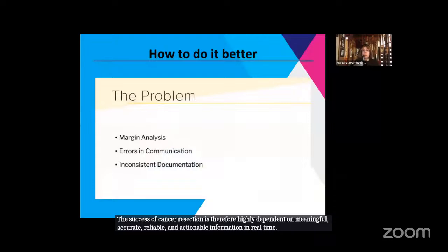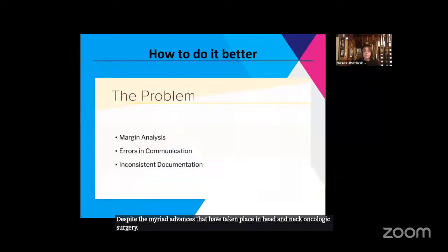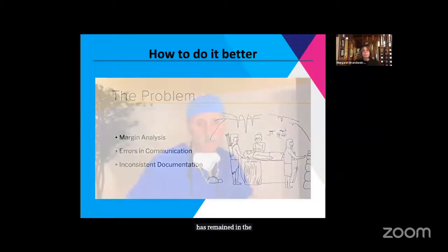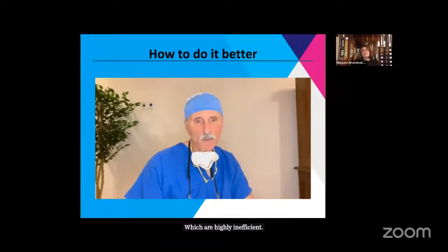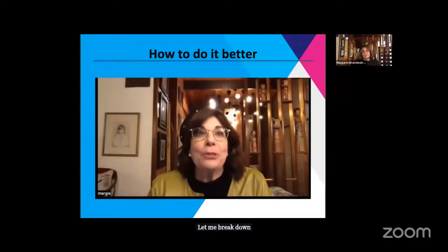Despite the myriad advances that have taken place in head and neck oncologic surgery, the essential practice of margin analysis, communication, and documentation has remained in the Stone Ages. At the core of understanding this proposal is an appreciation of current practices, which are highly inefficient and fraught with potential pitfalls. Let me break down the standard process of intraoperative cancer mapping.